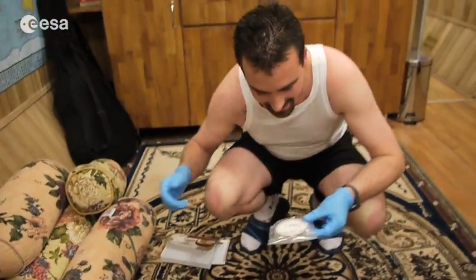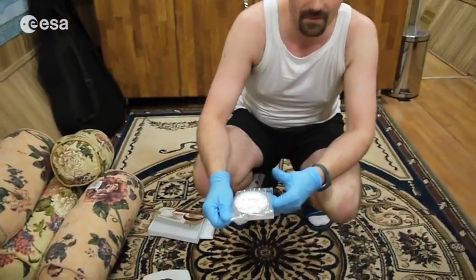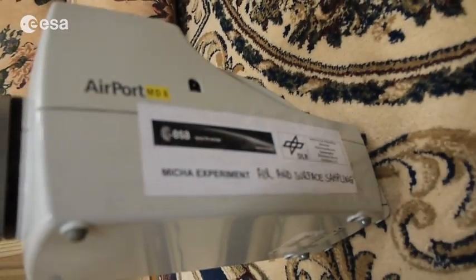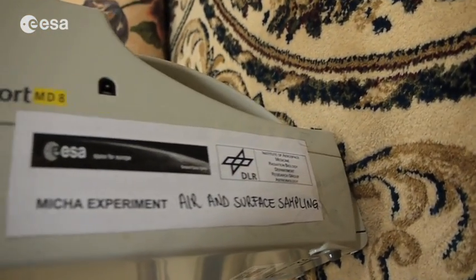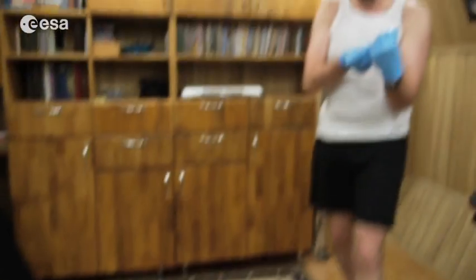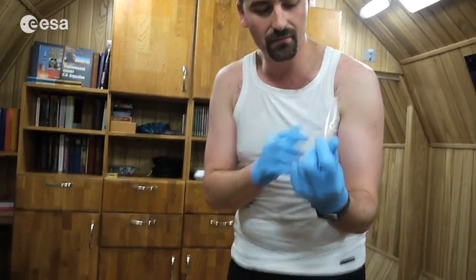What is that for? This is one of the European Space Agency experiments and the idea is to find out the evolution of the bacteria and all the small things that are living in the air — to detect them and make sure that we don't have too much, which could cause illnesses or other problems.